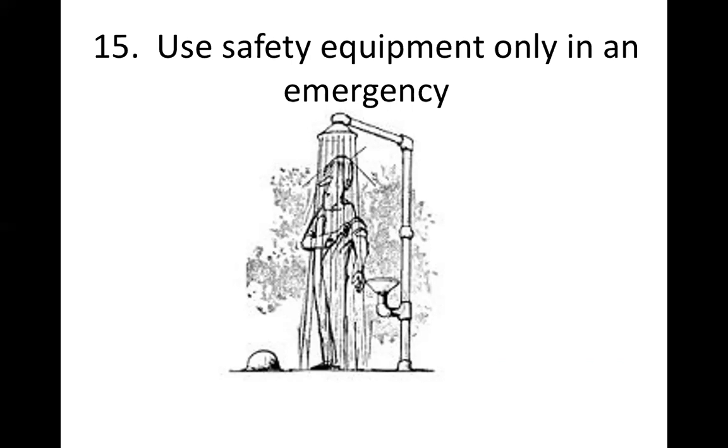We do not play with the shower. We do not open it just to see if there's water in the shower or if it's working properly. We do not play with it. It is a safety equipment. Therefore, we use it only when it's necessary.